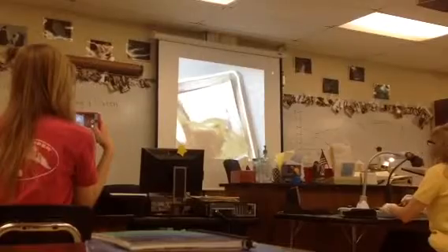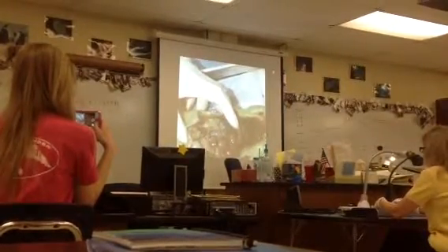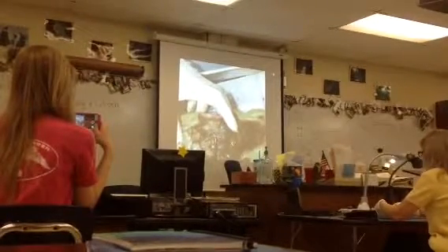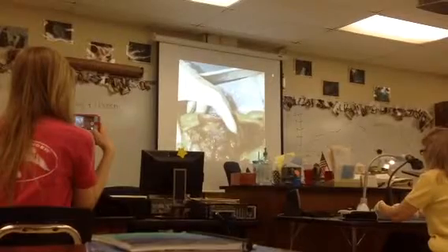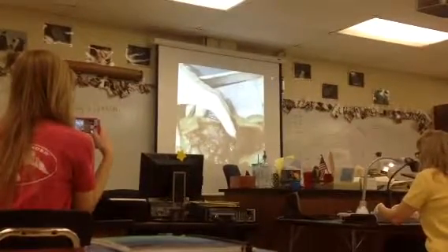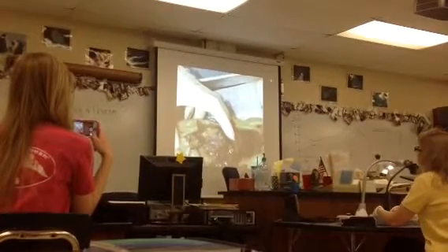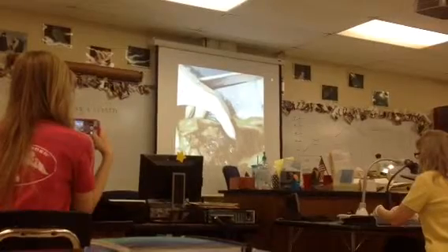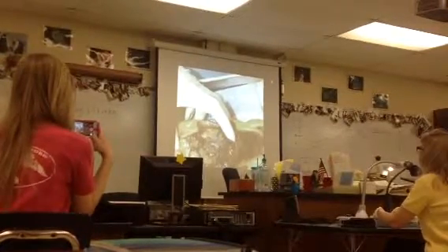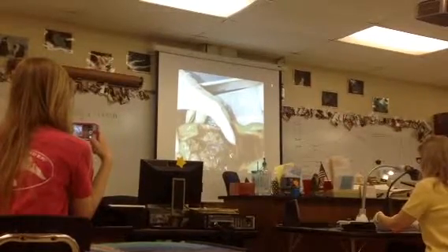Then down here in the abdomen, you have to know this big blue one is the inferior vena cava, and then next to it, this pink one is the abdominal aorta. Then you also have to know with the kidney, the blue one going into the kidney is the renal vein. The pink one going into the kidney is the renal artery. So you can see those two right there side by side. Then this is the kidney right here.